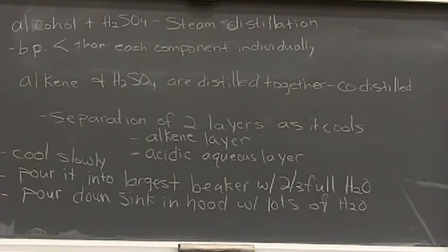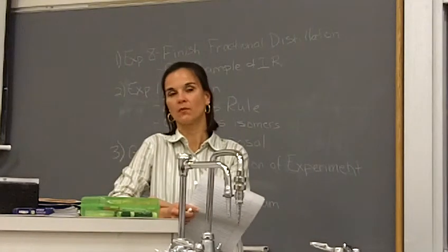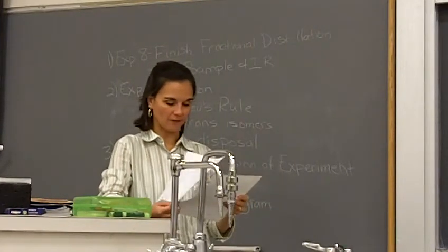Questions with that before I go on to gas chromatography? Yeah. I just wanted to verify, so for our pre-lab, that's basically done on experiment 11 only? Yes, yeah. You can show the filtering, what you use, your new apparatus will be filtering with that pipette, but you don't have to draw a GC as new equipment or anything like that in your pre-lab. Okay. All right, so now let's talk about gas chromatography, okay?